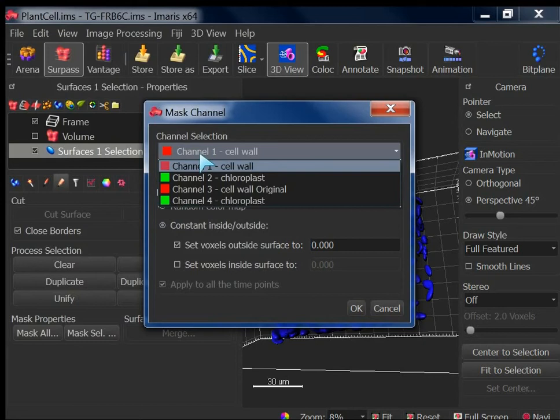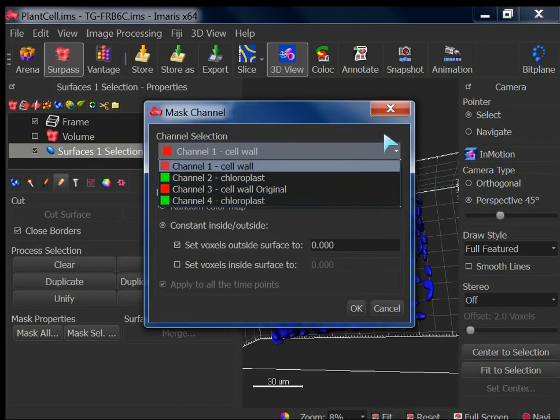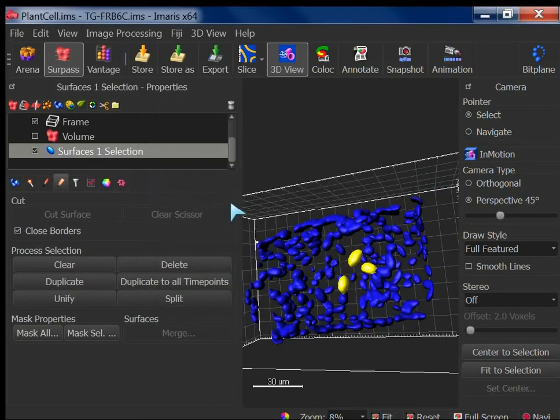And that's where I want to show you the MATLAB. Okay. If it's not possible. So if you create now a new mask, you can mask an already masked channel. Like if you do mask, then can you use it on, for example, one of the channels that you created before? See, whatever you see here, you can apply everything. It doesn't matter. Now, let's do what you said. Let's say it's a mask channel, we don't have it here, but let's create that and apply it again on the mask one.